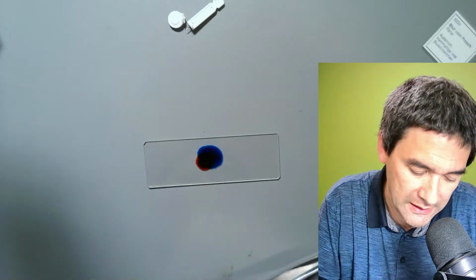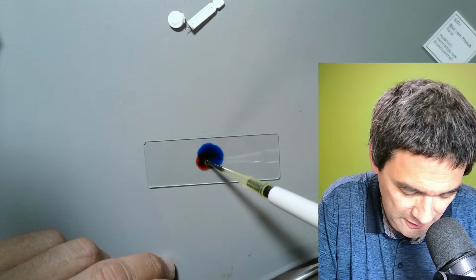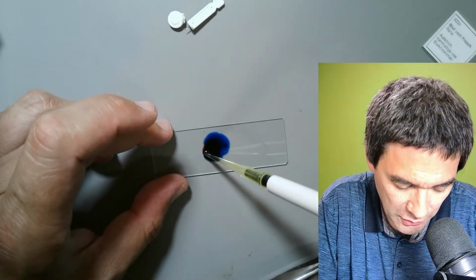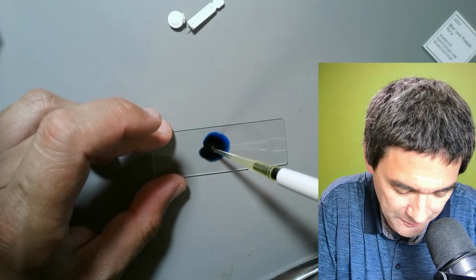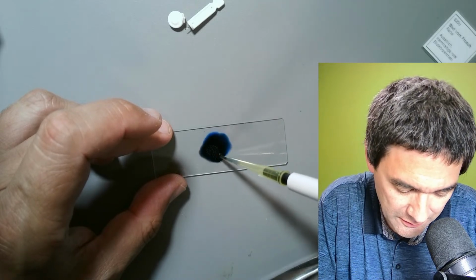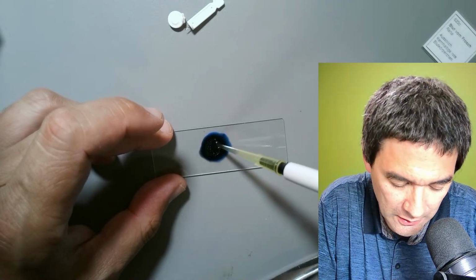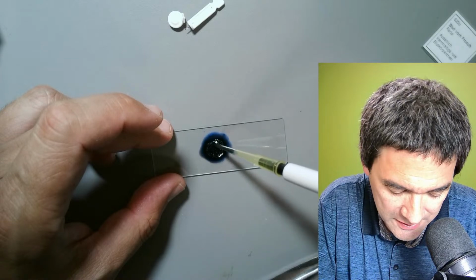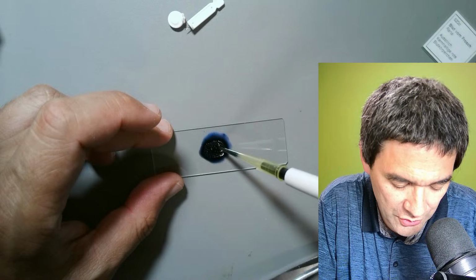And what I found out, what is really important, is you have to mix it properly. I do that by simply drawing it in and out, because if you don't do that, I found out that not all of the cells are properly stained. Okay, so I do this a little bit. This, of course, will kill the white blood cells. There is potassium hydroxide. There is also alcohol.